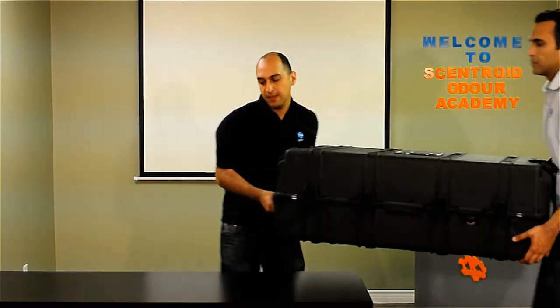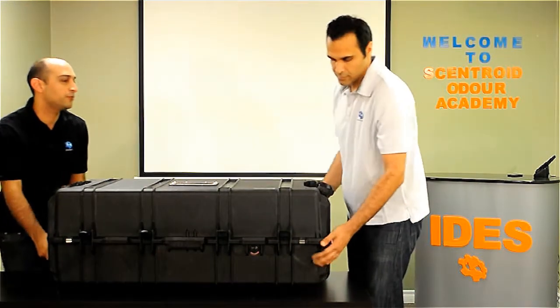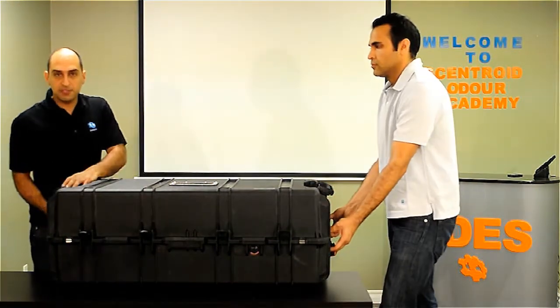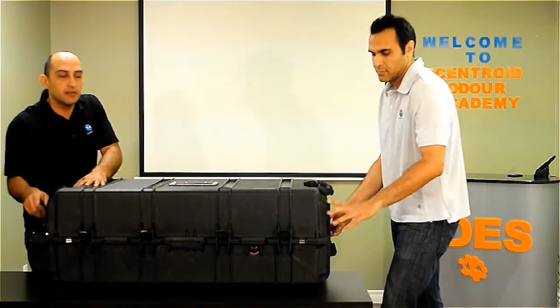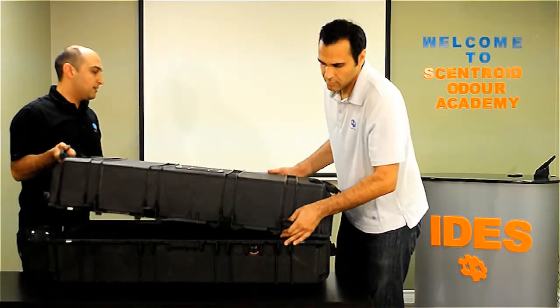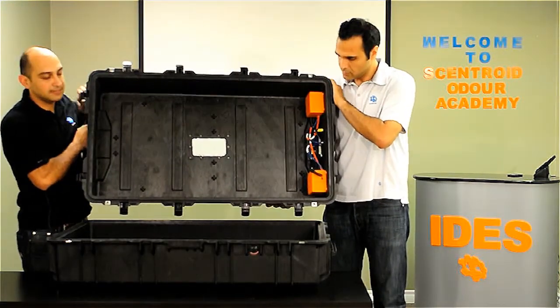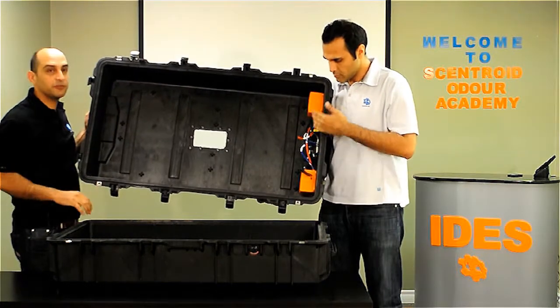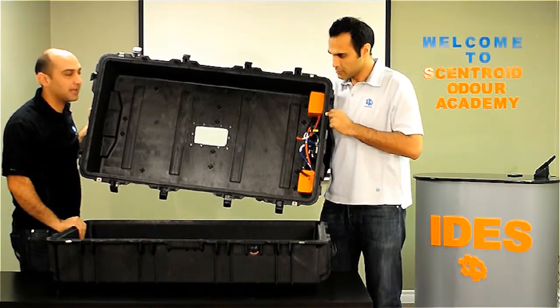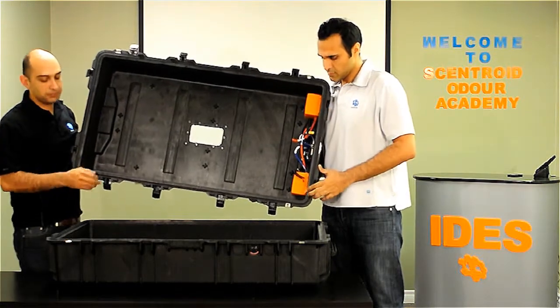We also have the 50 liter version — you can put it on the floor. This one is a fairly massive unit. It's usually not necessary for most stack sampling, but sometimes for ambient sampling, 40 or 50 liter bags are used. On this one, the pumps sit in the lid, which gives a bigger volume in the lower chamber for the bag. Again, two pumps and fairly simple operation.